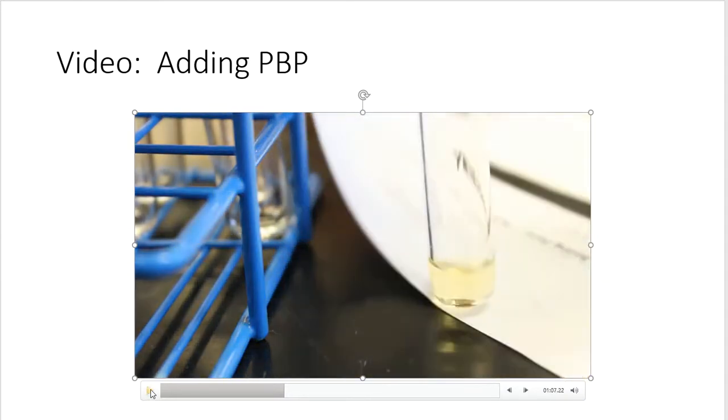All right, so folks, the reason I'm pausing this at this moment is because I do not want you to get confused. Depending on the concentration and depending on the amount, you could have some residual color that stays behind. So what you're looking for here is the initial 2 drops. Did it go colorless? If so, it's a very good sign that this is positive for an alkene. And this is octene. So you should know that octene is an alkene, therefore it should have a positive test with this. And that's what you saw in the first 2 drops.